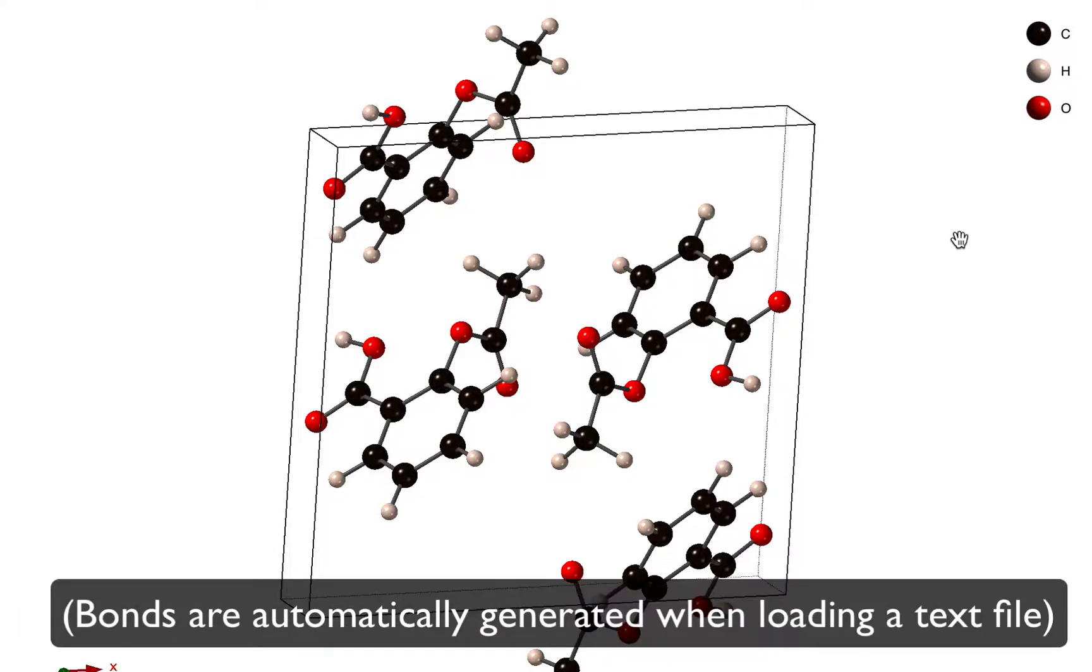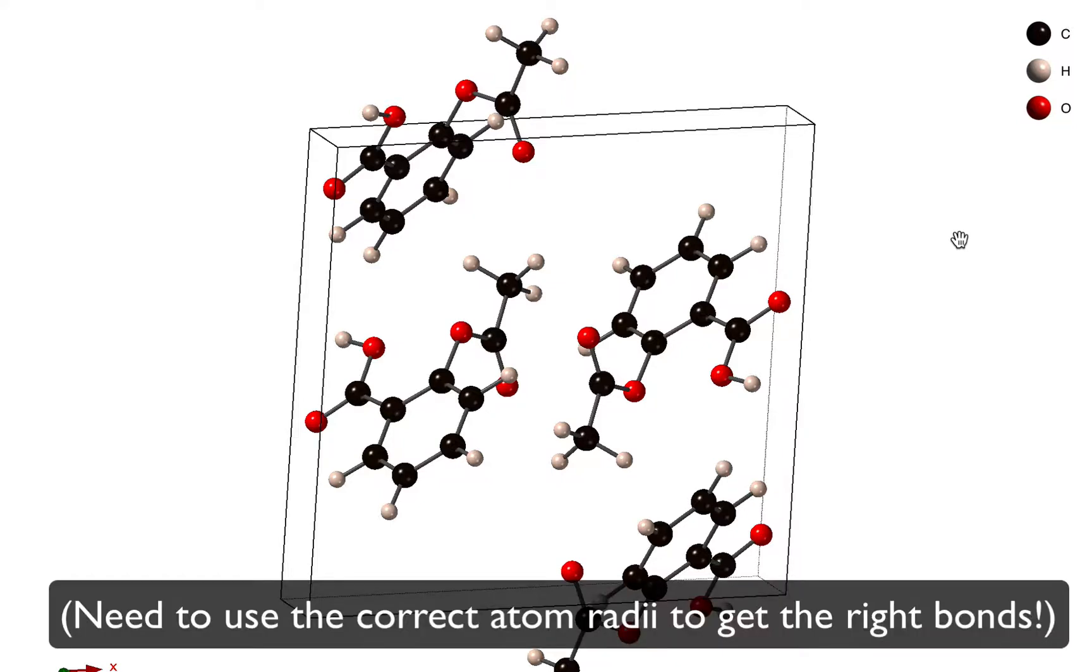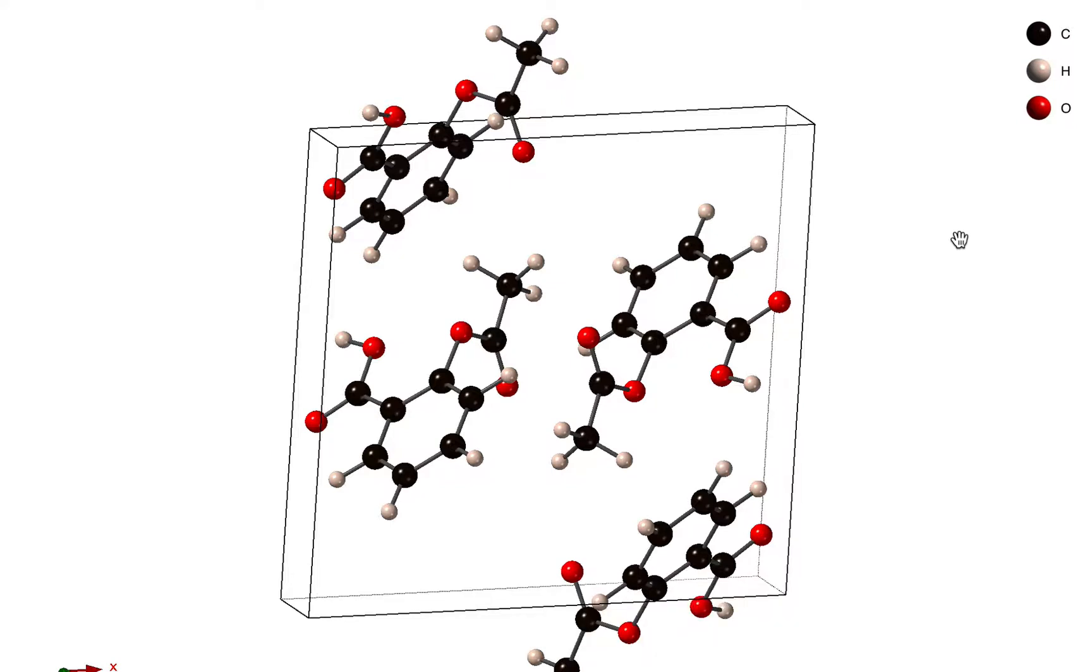CrystalMaker will automatically generate bonds when reading from a text file, and it generates bonds based on the interatomic distances. The idea is that bonds are created if two atoms lie within the sum of their radii plus or minus 15 percent.